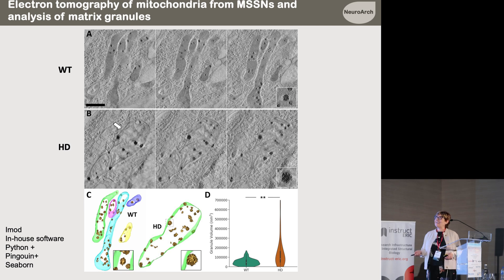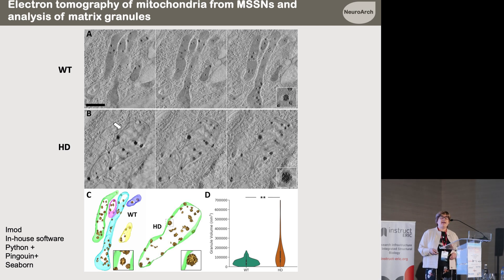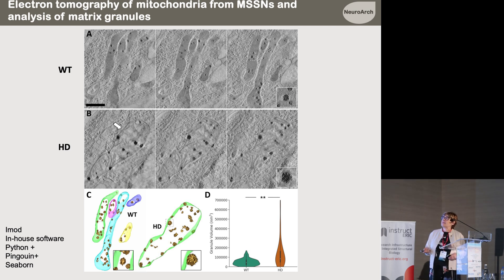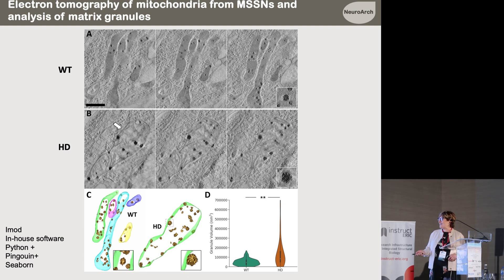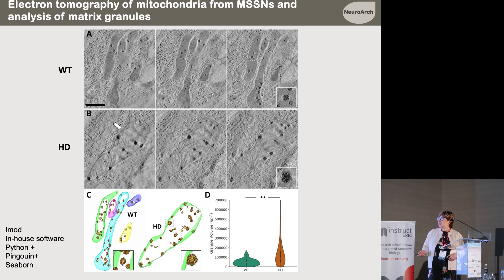To examine the details we were not able to analyze with FIB-SEM — such as the matrix granules — we needed to zoom in and use electron tomography, which provides higher resolution. You can see here the differences in mitochondrial shape we observed before. We segmented all the matrix granules and quantified their volumes, and confirmed in an objective quantitative way that matrix granules are significantly bigger in HD conditions, in the mitochondria of HD neurons.